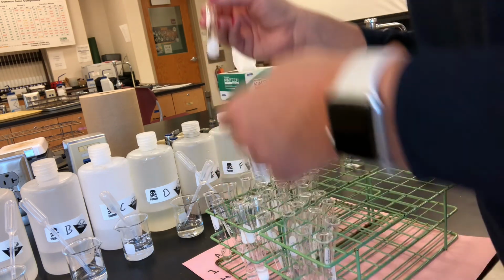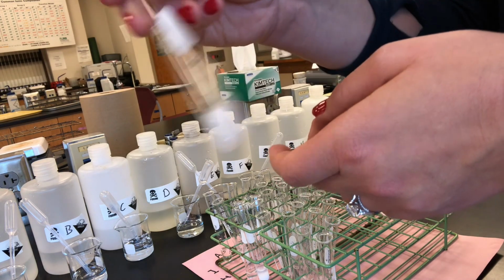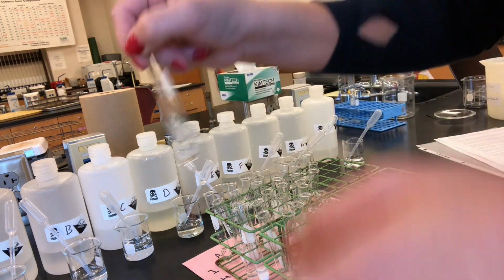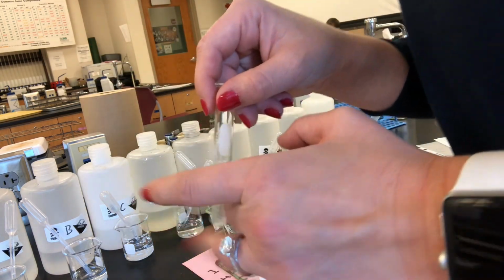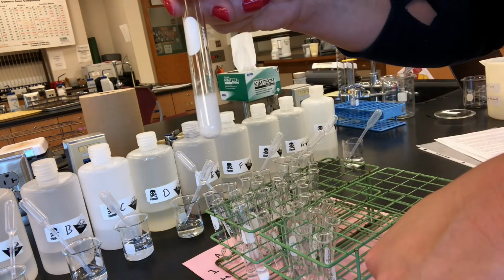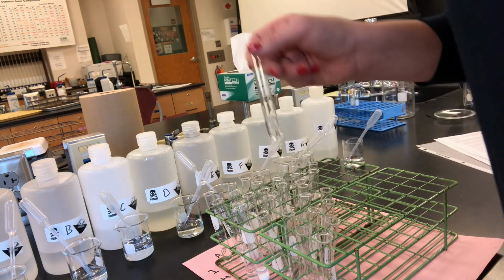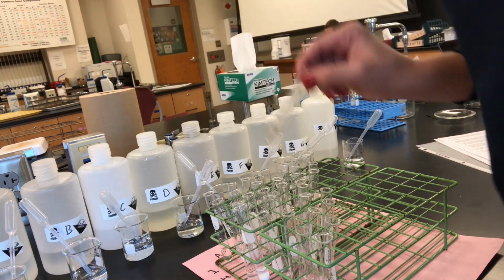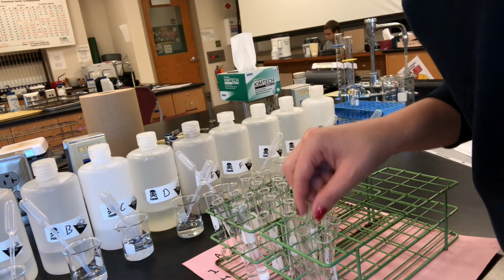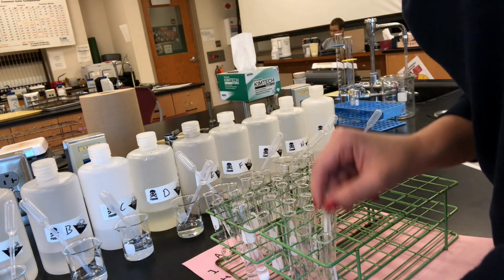B and I, got nothing. B and H, definitely got something thick and sludgy in there. B and G, looks like nothing. B and F, white precipitate formed. B and E, no change. B and D, no change. B and C, no change.